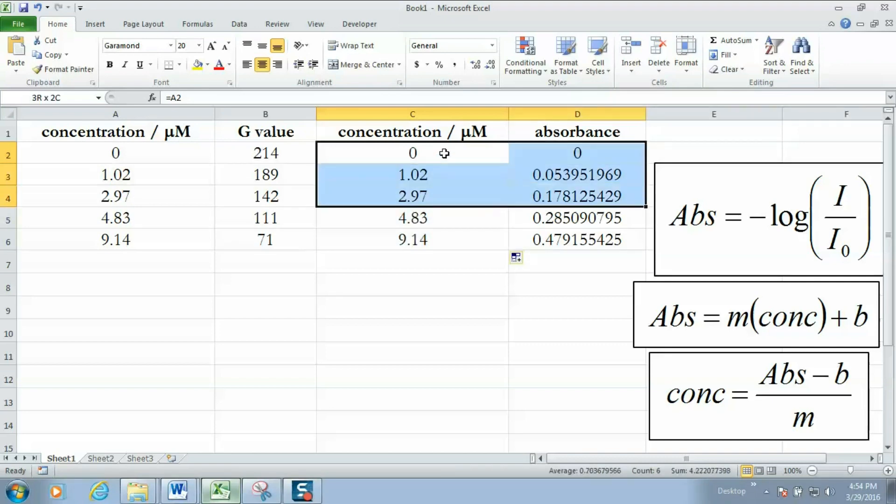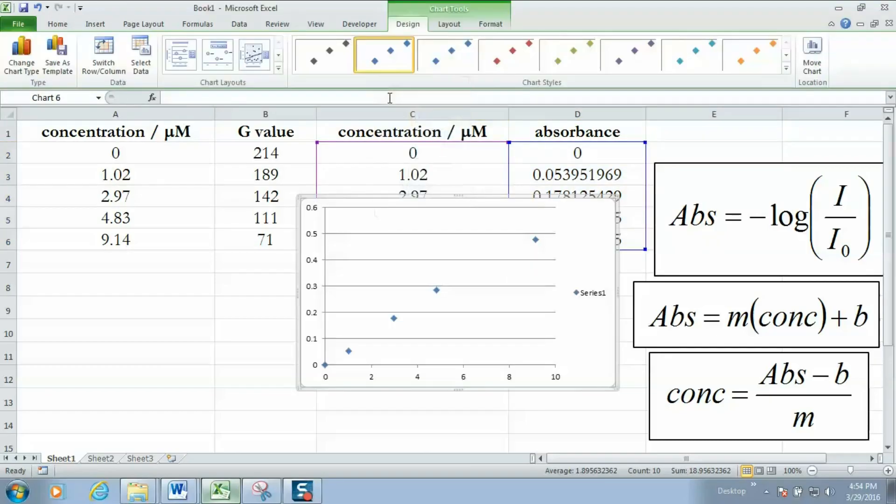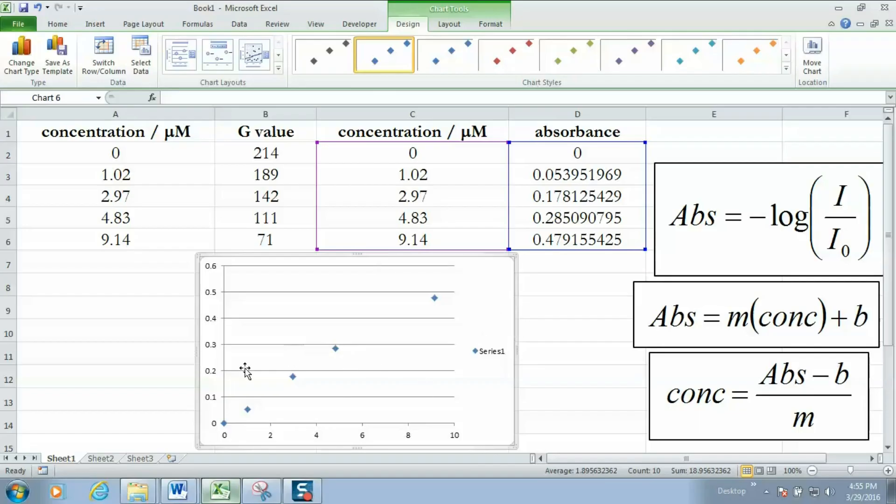I'm going to highlight the data and we're going to plot them. I'm going to insert a scatter plot and our data look fairly linear. In our plot here you should recognize that the y-axis represents absorbance and the x-axis is going to represent concentration in units of micromolar.